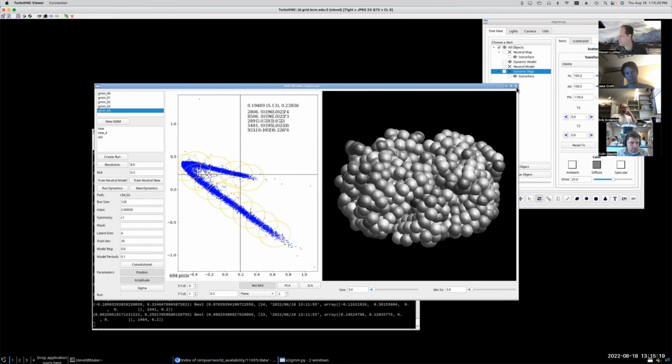All right, I think that's probably it. And we've gone for an hour and 15 minutes today. Anyone have any questions about this stuff? Like I say, it's still kind of in development. You'll still see more and more changes in the GUI appearing over time, but the basic tool is there and basically functional.